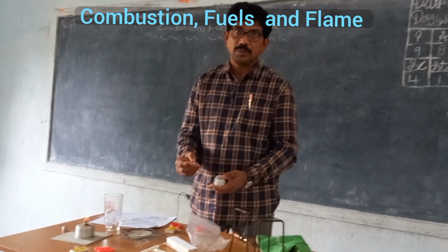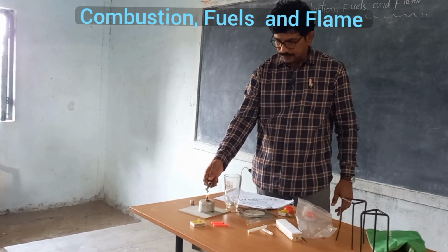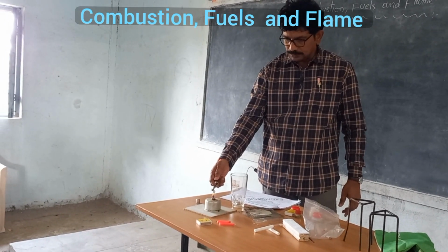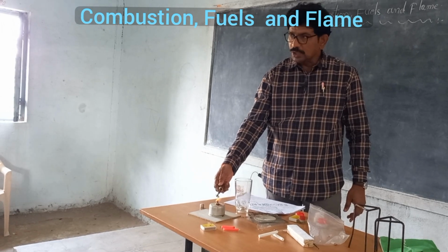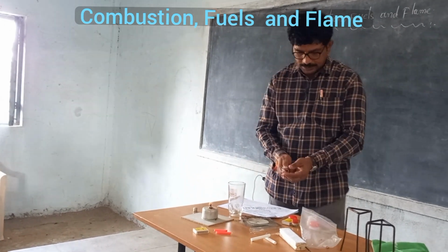I have taken some zinc metal, I am trying to burn it. Zinc metal is not burning.